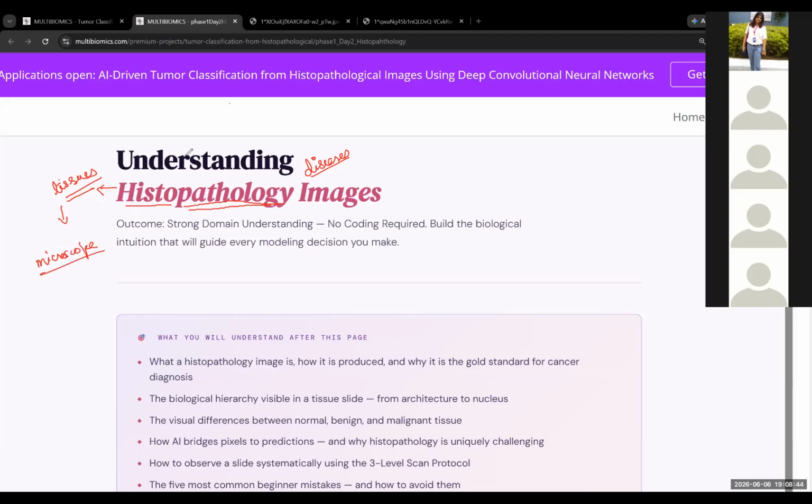When we observe these cell or tissue level images, they are transparent, so you have to stain them. Particularly in histopathology, the most used stain is the H and E stain. Please note it down. Even if you're not noting it down now, if you go through the recorded video later, just note it down. You must know these things. This is known as hematoxylin and eosin.